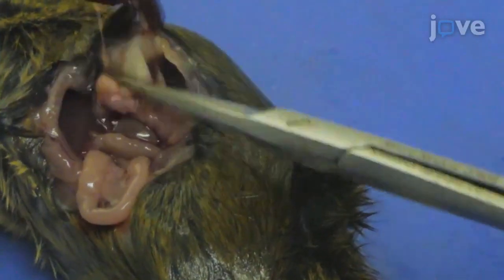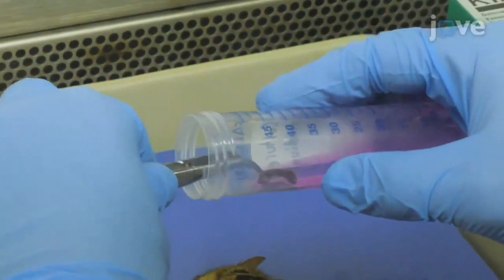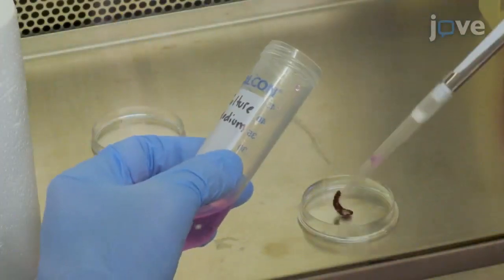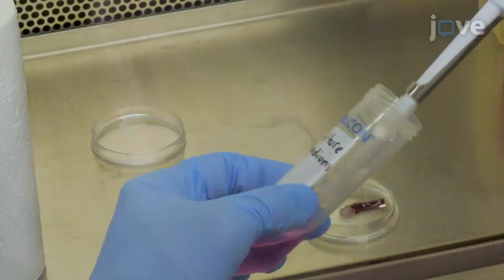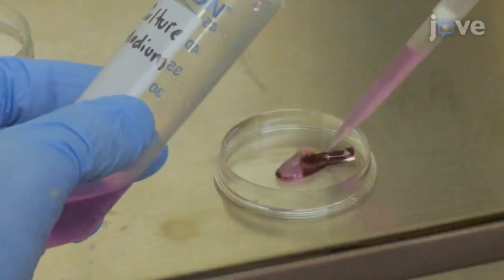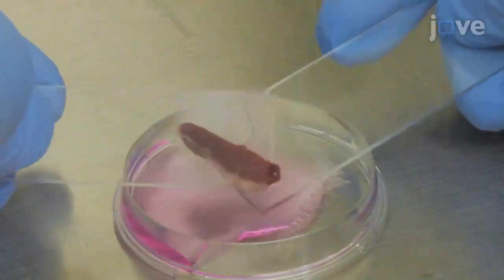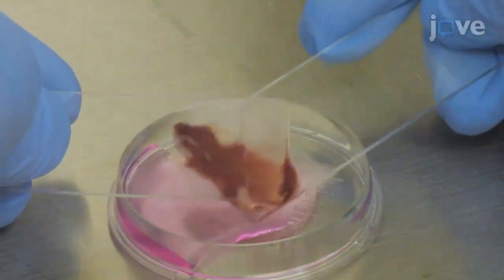Remove the spleen with forceps and place it into a sterile 50 milliliter tube containing approximately 10 milliliters of culture media on ice. Then transfer the spleen with 2 milliliters of culture medium to a small sterile petri dish. Homogenize the spleen by grinding it between the frosted portion of 2 sterile frosted slides.